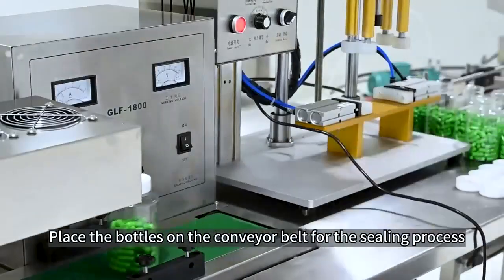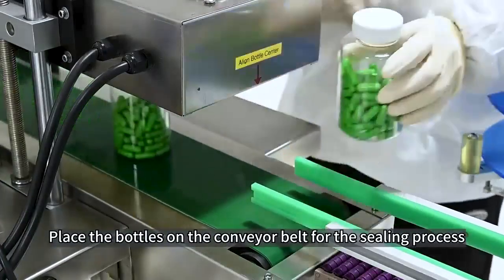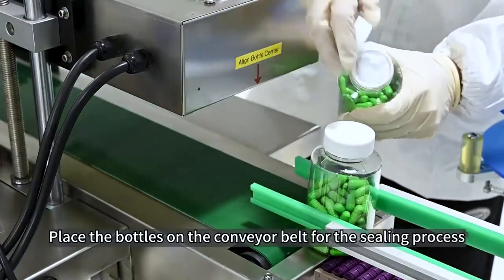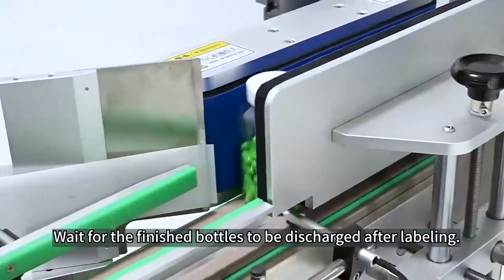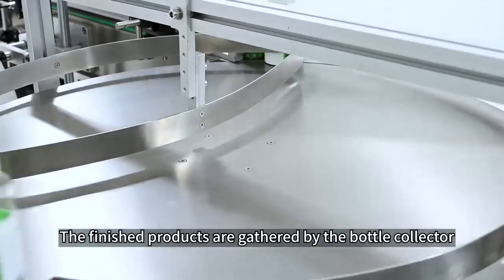Place the bottles on the conveyor belt for the sealing process. Wait for the finished bottles to be discharged after labeling. The finished products are gathered by the bottle collector.